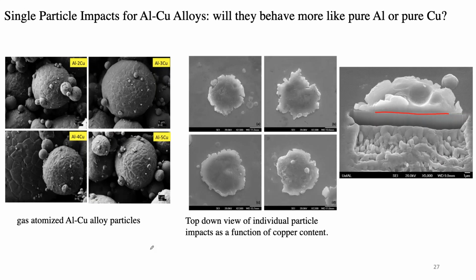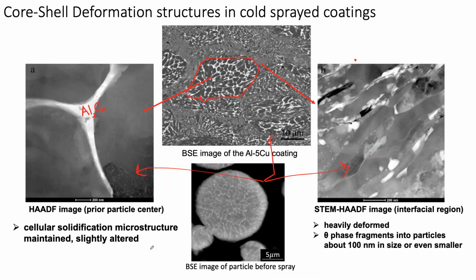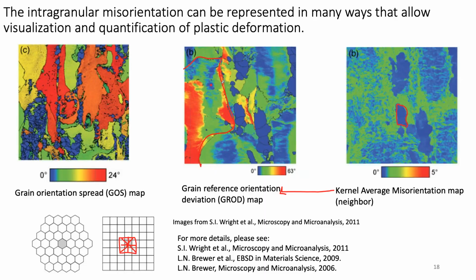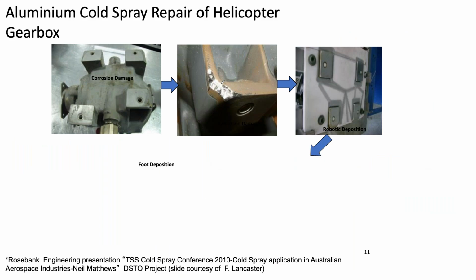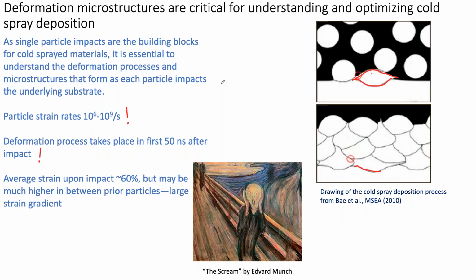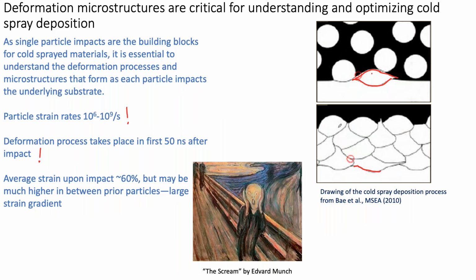So right, this is what particles look like in a coating, or actually, I think the cartoon by Bay is even better. There you go. So depending upon the properties you require from the material, it's going to set the minimum thickness that you can make, right? So this is 1, 2, 3, 4, in this cartoon, 4 particles.